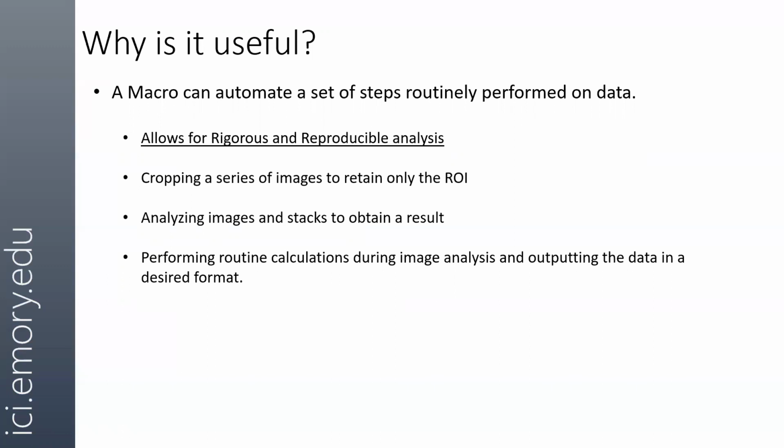Now, if you've got data sets that are pretty well contained, where you capture the data in the same way, and there's not too much variation aside from the signal that you want to see, then they're a very powerful way of being able to analyze that entire stack of data in the same way very quickly. So it allows you to be very rigorous and produce very reproducible analyses, which is one of the big points.